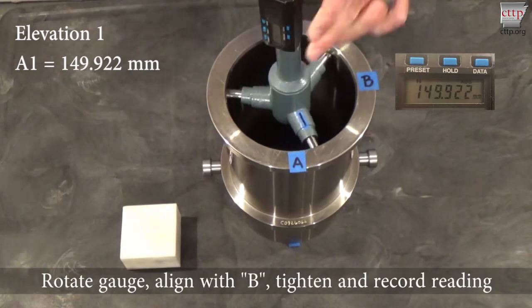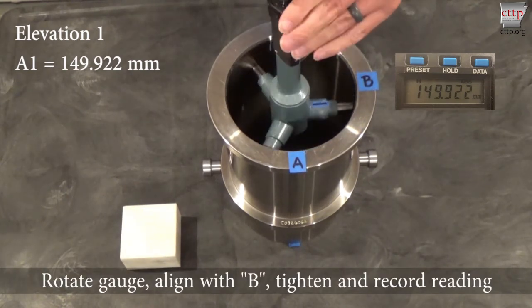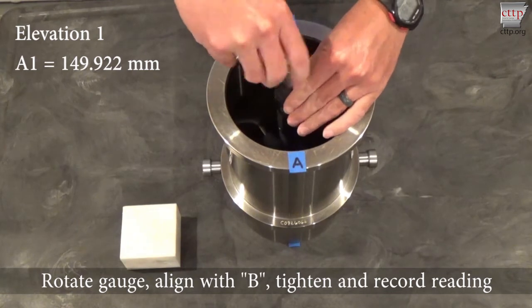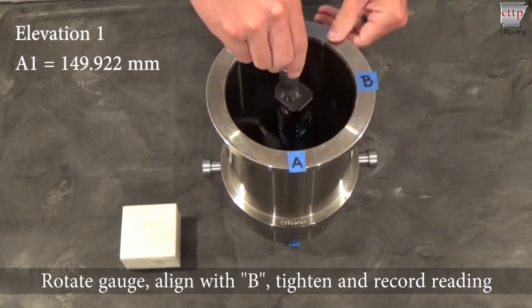Rotate the bore gauge and align the arm with position B. Tighten the bore gauge, record the reading, and then loosen the bore gauge.